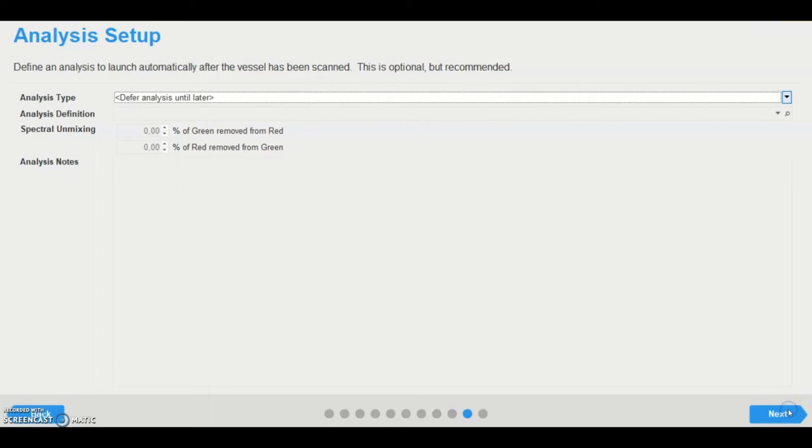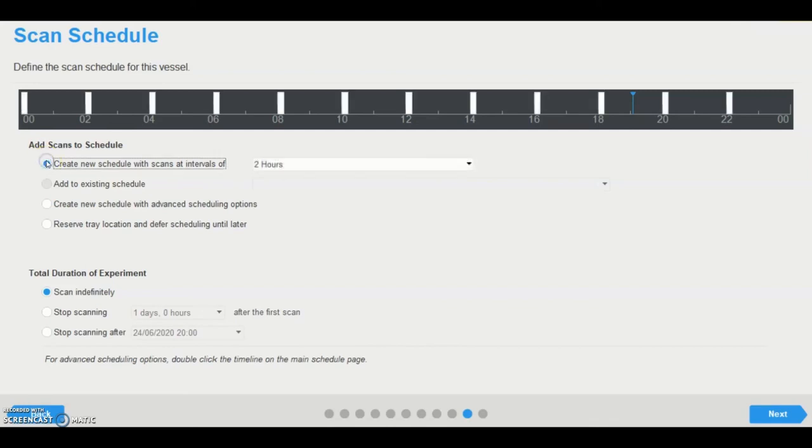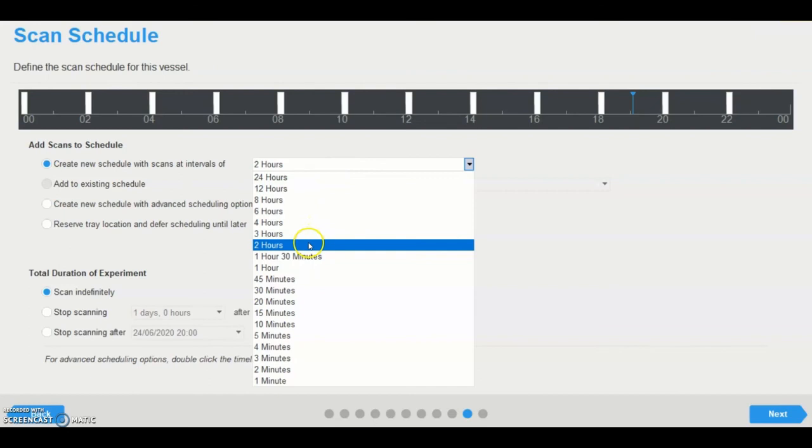On the scan schedule page, the user specifies the schedule for the vessel. There are four options to add scans to a schedule. User scan: create a new schedule with defined scan intervals, for example every two hours, independent of the existing schedule.